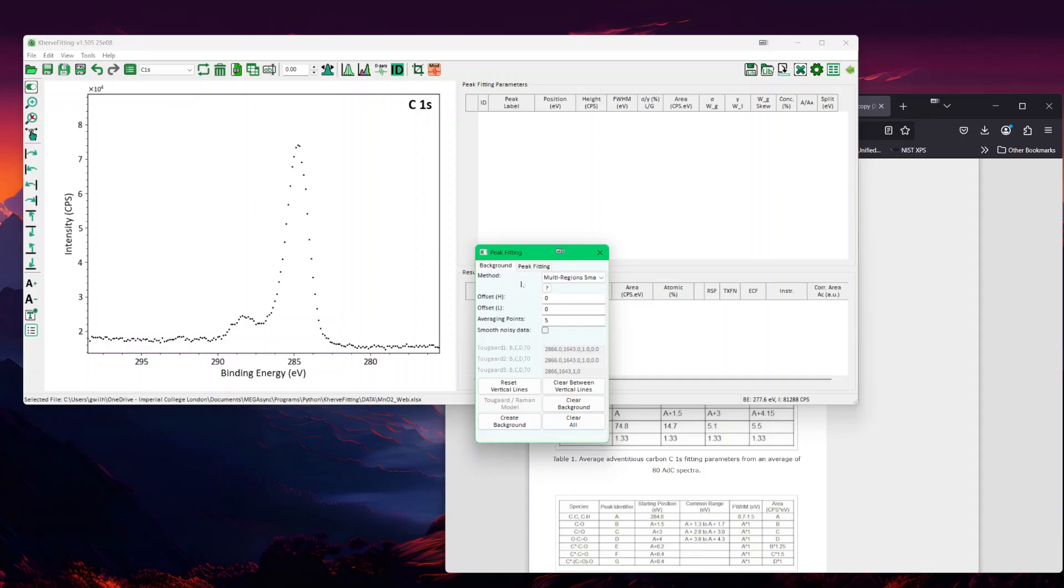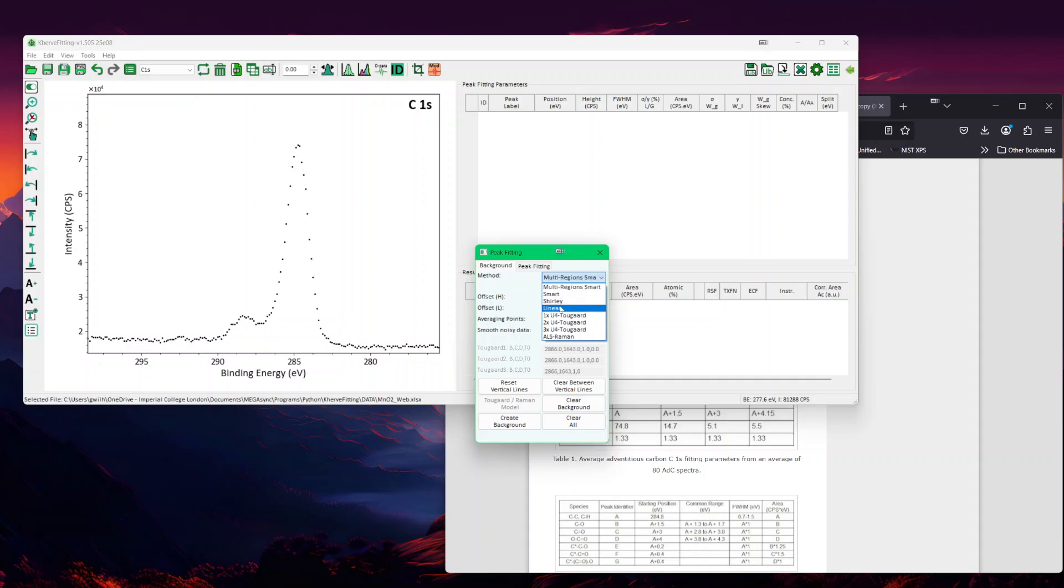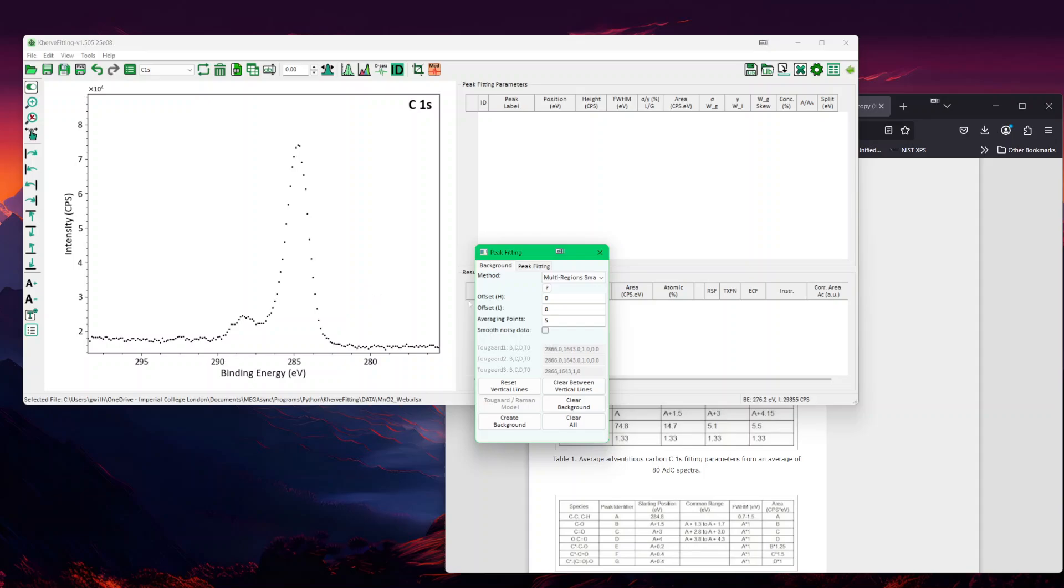The first tab is for the background. The second tab is for the peak fitting. In the background, you have the methods which provide you different background types. One is called the linear, the Shirley, a smart which is a combination of linear and Shirley depending if the background goes down, then it's linear, or the background goes up and that means it's Shirley. The multi-region smart is the default one, that's the one I would tend to use.